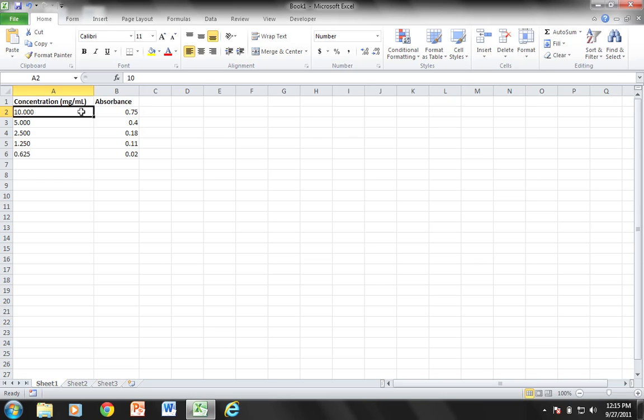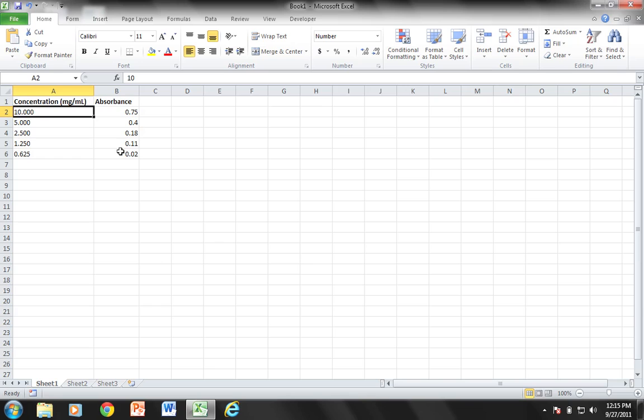So again, I was asked to show you how to make a standard curve using Microsoft Excel. Like I did in the Mac equivalent to this video, I have typed in my concentrations that we use during our serial dilution as well as the relative absorbances as they corresponded to those concentrations.